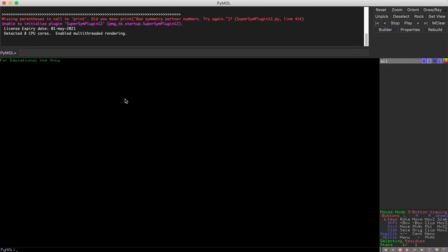So usually the missing residues or the missing regions are short fragments that are missing from the PDB file, so they could not be resolved by the X-ray crystallography method for various reasons. Maybe the resolution wasn't good enough, or the process was very cumbersome, or for that matter, these regions didn't form a structure at all. If these are very flexible regions, as you have seen previously from temperature factors, some of these regions appear to be very high in temperature factor, which means they are very, very flexible in nature. In that regard, they could not be resolved by X-ray crystallography, especially. Maybe through NMR methods, they might be resolved to a certain extent.